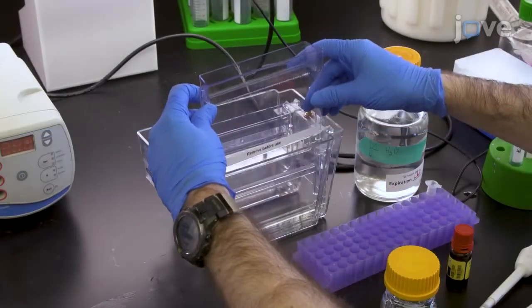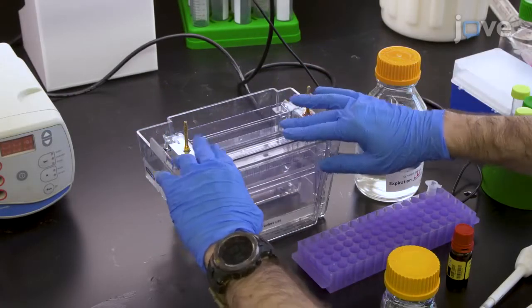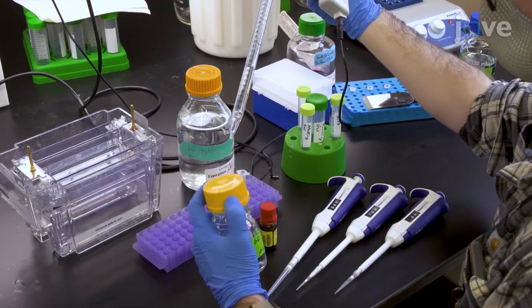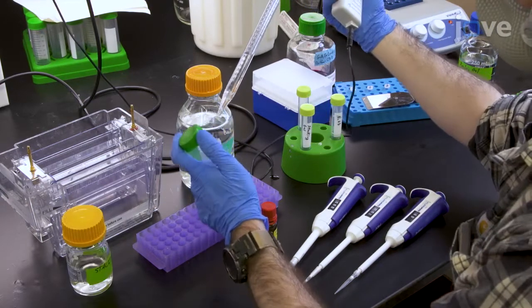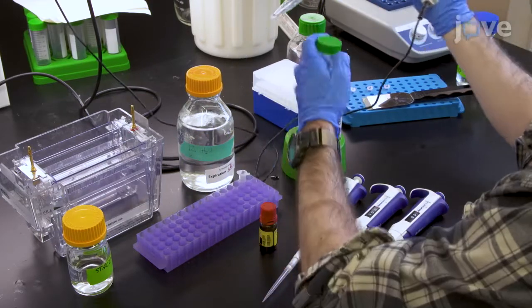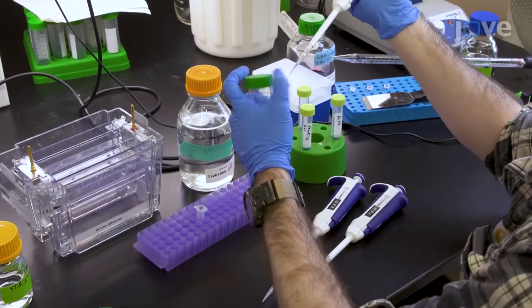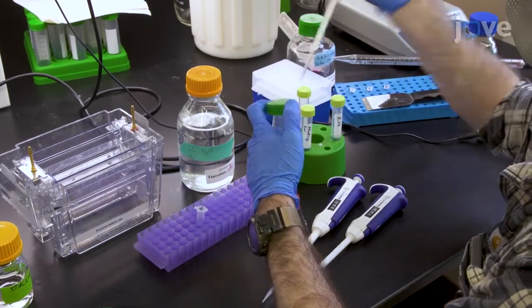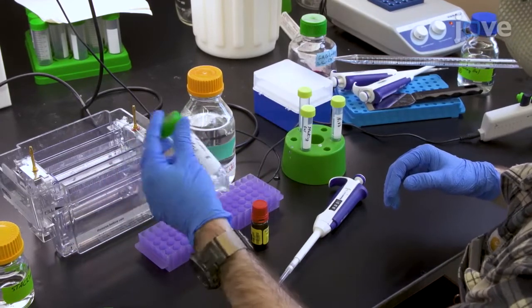Start by placing an empty cassette into the page tank. Cast the resolving gel by mixing 10 milliliters of resolving gel solution with 60 microliters of freshly prepared 10% ammonium per sulfate in a 15 milliliter tube. Then add 10 microliters of T-Med. Invert the tube gently 2 to 3 times.